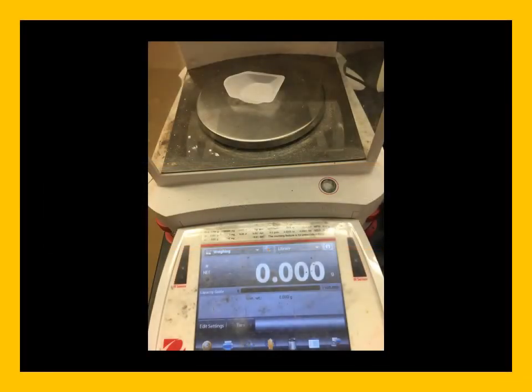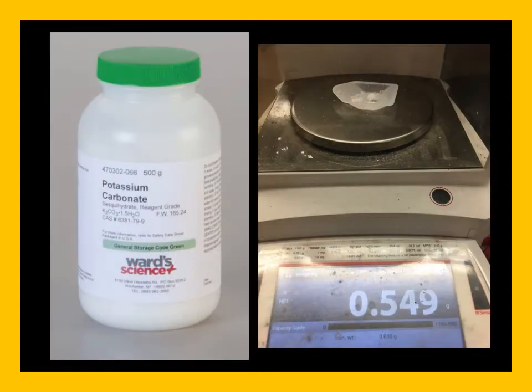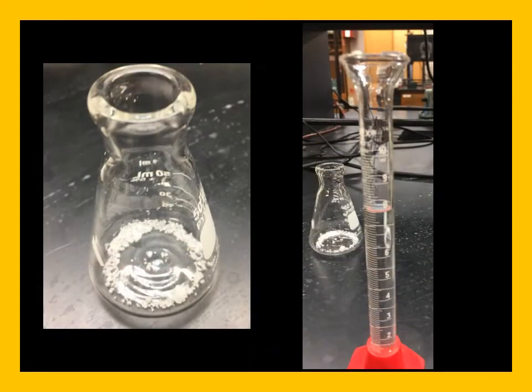In the first step of the reaction, we're going to use an appropriately sized weigh boat. We're going to be weighing out about half a gram of material. So you can see that I chose one of the smaller weigh boats, and I've tared it on the balance. Now I'm going to weigh out my potassium carbonate, and you can see that we're using 0.549 grams of potassium carbonate. I've transferred this potassium carbonate to a 50 mL Erlenmeyer flask, and I'm adding 8 mLs, about 7.9 mLs exactly, of DI water to this flask.